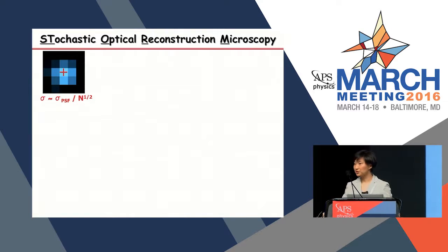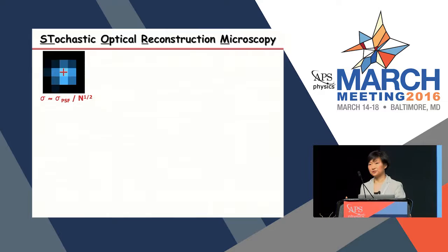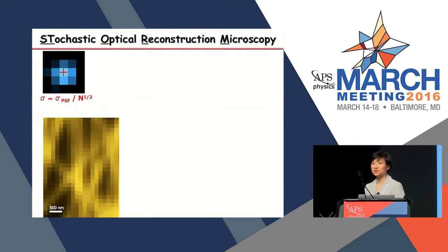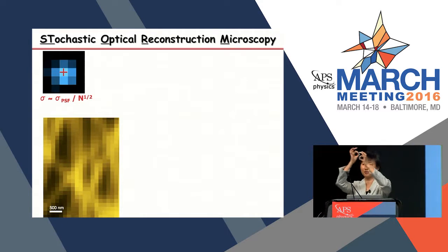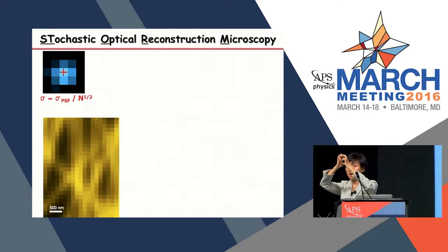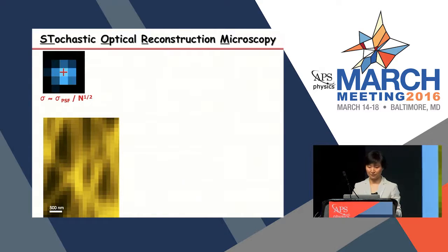That has actually been used as a powerful tool already to do biological investigation. However, that alone doesn't break the diffraction limit because, as I said, the diffraction limit comes in when 2 molecules are close, so their images overlap. How do you deal with that? And a biological specimen often is made of millions, not just 2 molecules, and their individual images all overlap and give you a complex pattern. How do you find the positions of individual molecules? So that's where we came in.